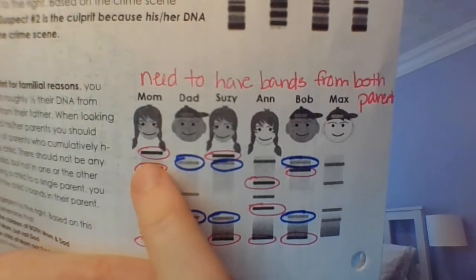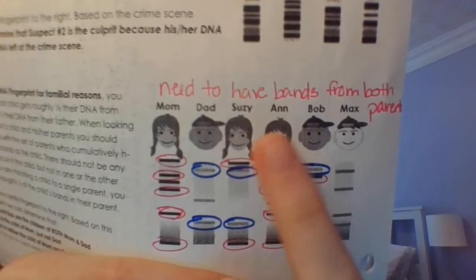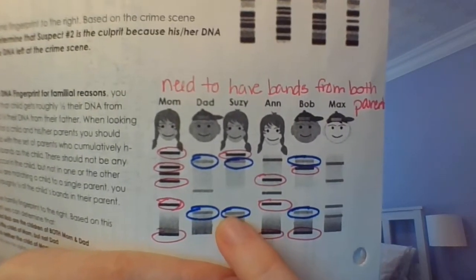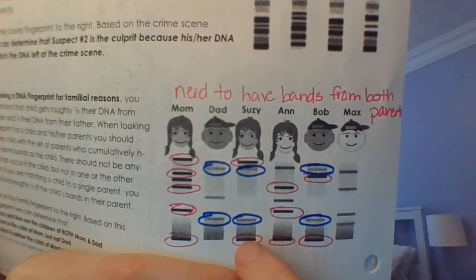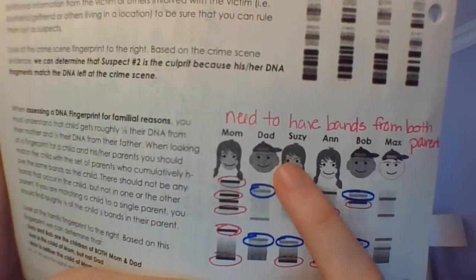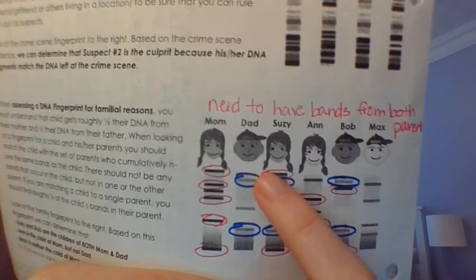Notice that the mom has bands right here. Susie doesn't have any of them. That's okay. You've just got to make sure that the kid, every single one of their bands matches with a parent. Okay, so Susie has a band right here. That one's from the dad, so that one's good. And she has one last band right here, which comes from the mom. So we can say with certainty that Susie is the offspring of these two parents. All of her bands were accounted for.